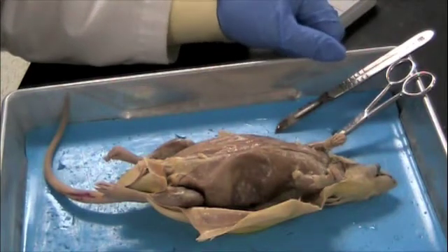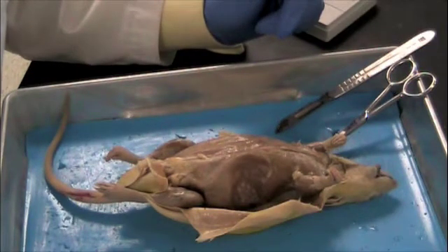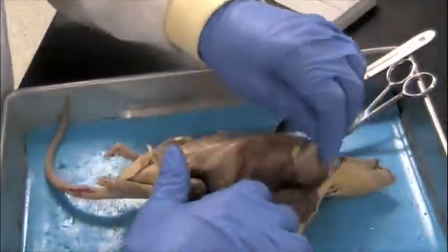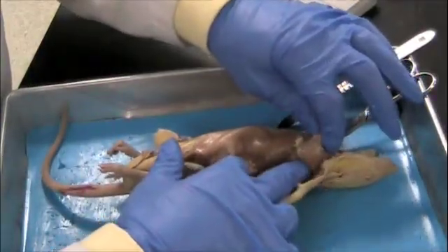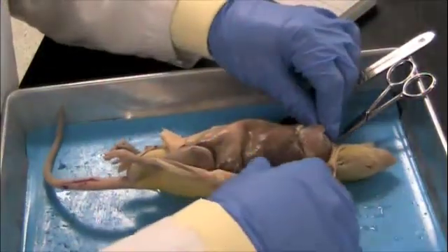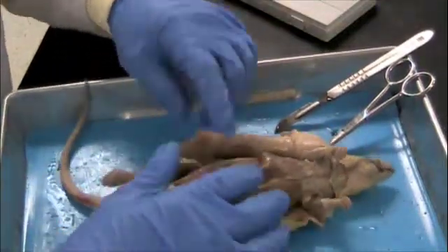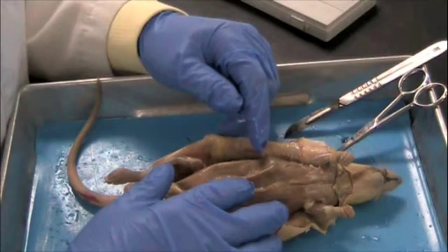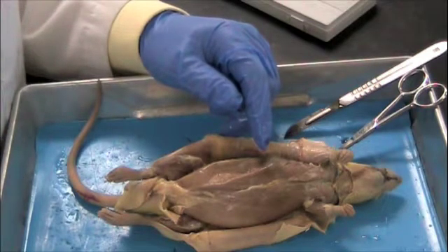Now that we've finished with the muscles, we'll go on to look at the bones. You're going to choose one arm and one leg to remove the muscles from and observe the bones. One of the keys to getting down to the bones is having easy access to the arm or the leg. Use a combination of your scalpel, probe, and scissors to remove the muscles until you get down to the bones, then we'll point out the different bones to identify.